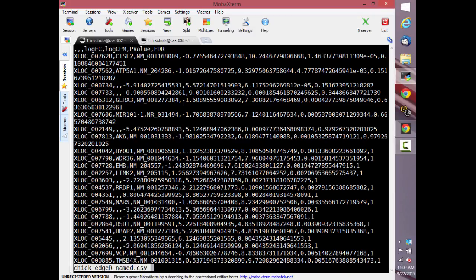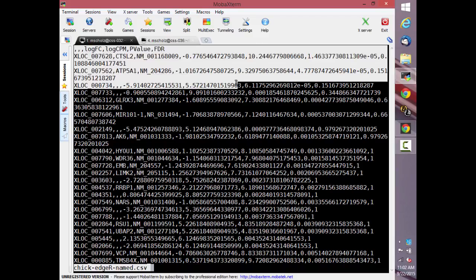So what did I do, right? This was a script that, again, doesn't get rid of the old information, but all it's going to do, and it's written in Python, if anybody wants to learn how to write scripts in Python, we teach a class on that too. It read in every one of those and added in information about the gene name and the annotation ID between the original locus ID and the fold differential change. That's all it did. Easy script. But now what we have is a list of genes that are actually something that we could be interested in.